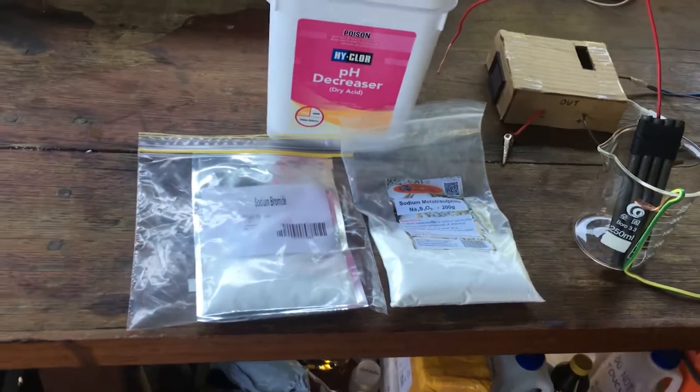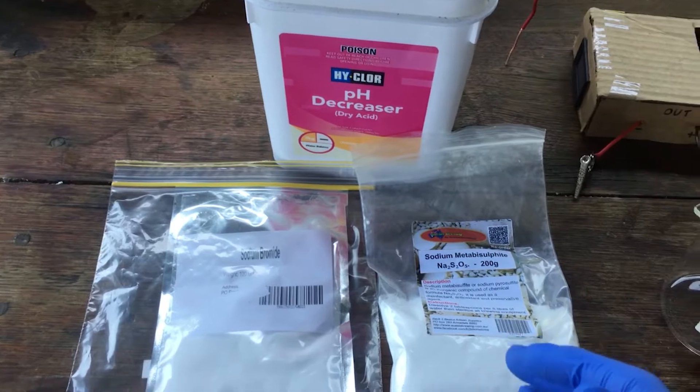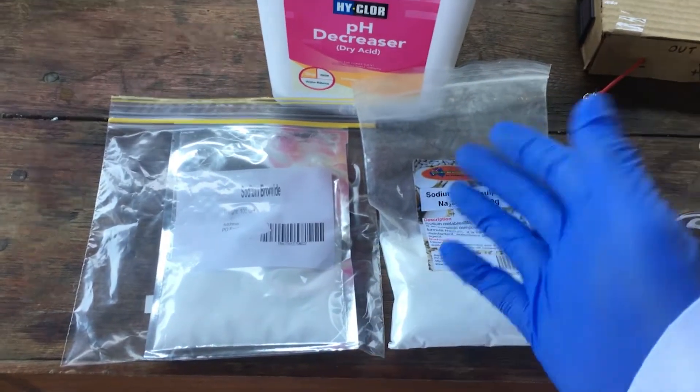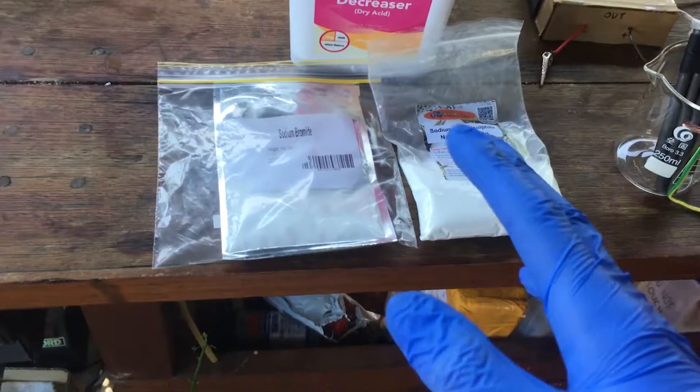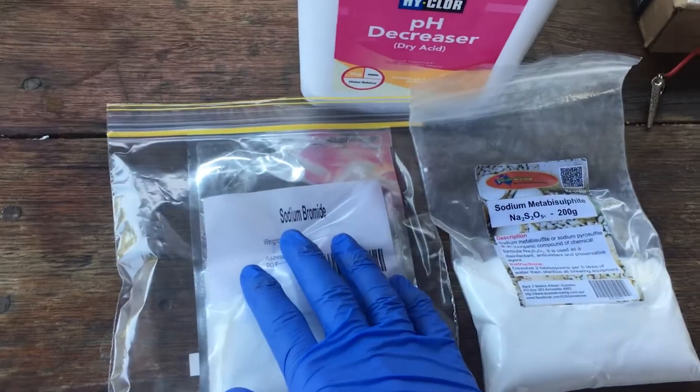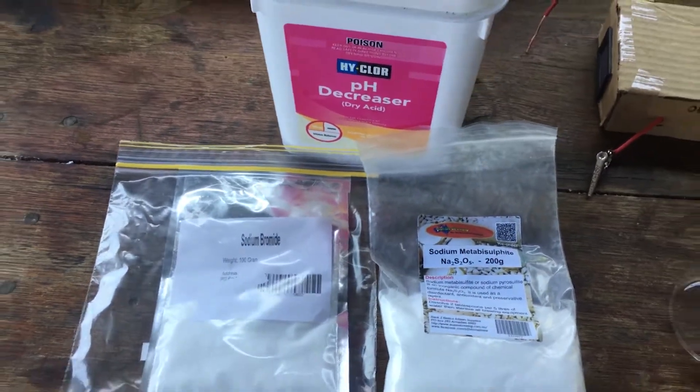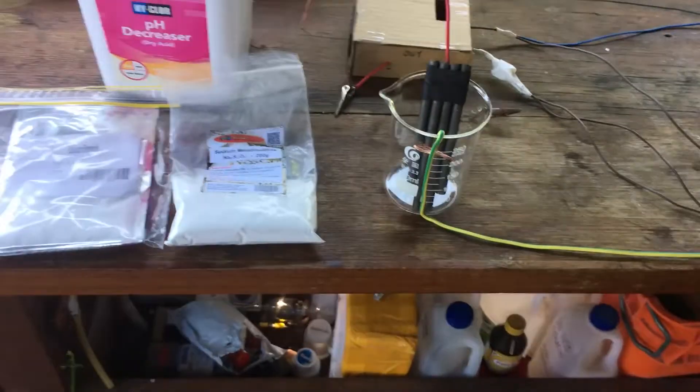This method that we're going to use to generate our elemental bromine is the electrolysis, like everything else on this channel, of sodium bromide. It's a little bit more complicated than just electrolyzing a solution of sodium bromide, but we'll get to that in a minute.